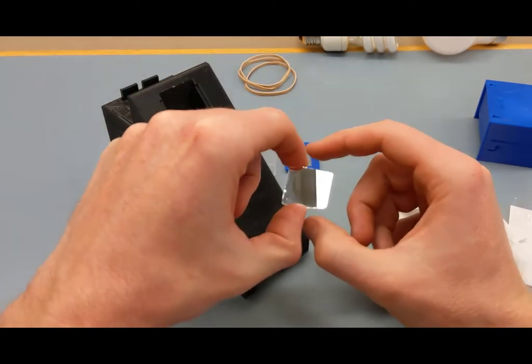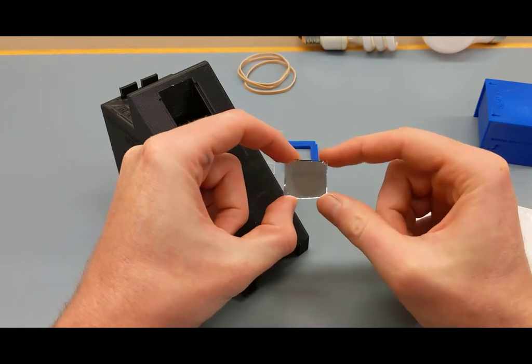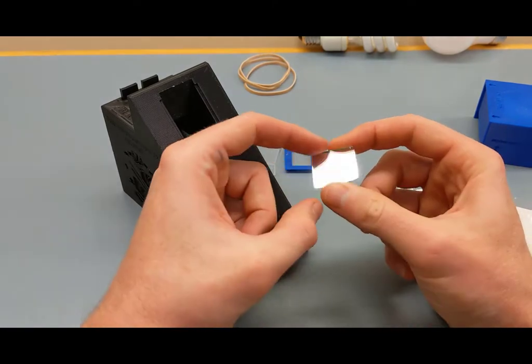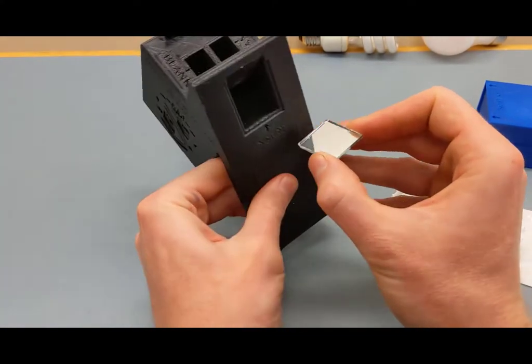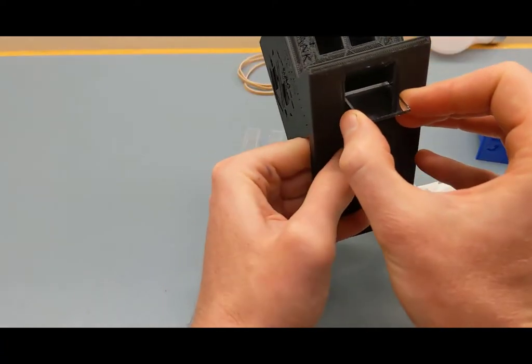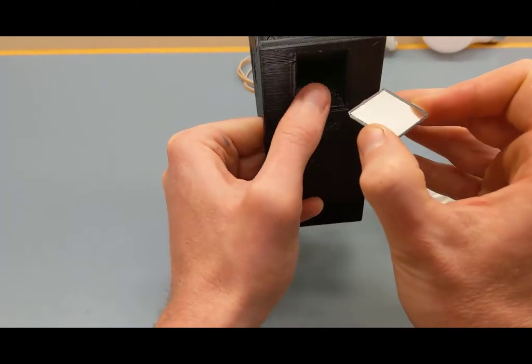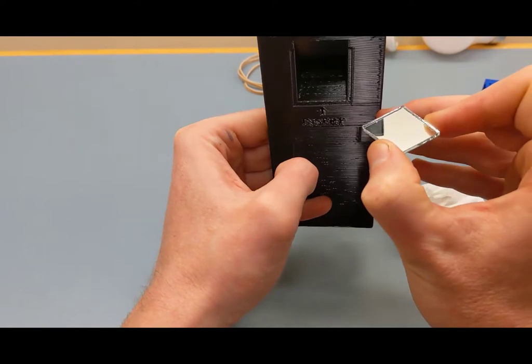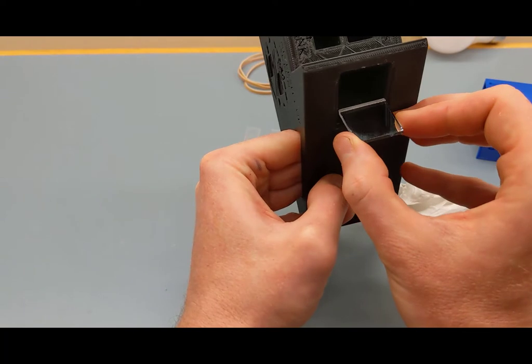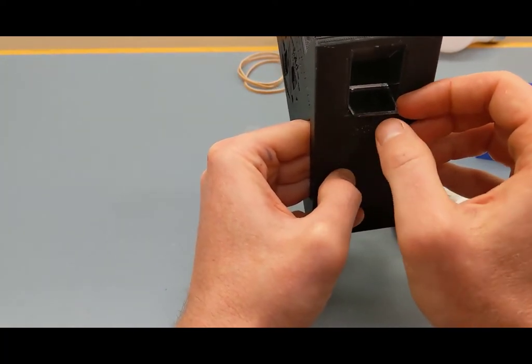Grab the spectrometer base again and rotate the mirror — it only fits one way. There's a thin dimension and a thick dimension; orient the thin dimension to slip in correctly. These were pre-cut before being sent to you. Hold the base so the 45-degree platform is essentially flat so the mirror doesn't slide down.